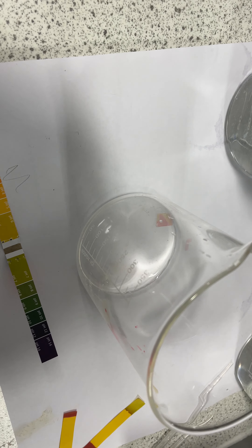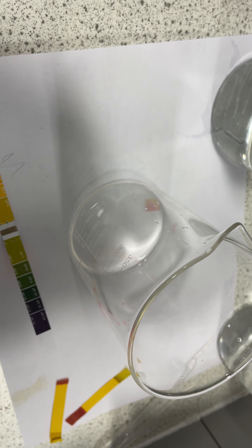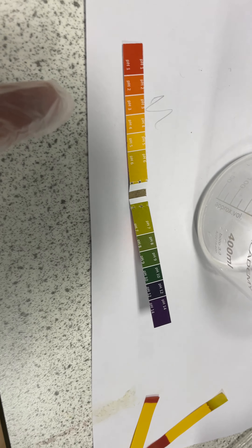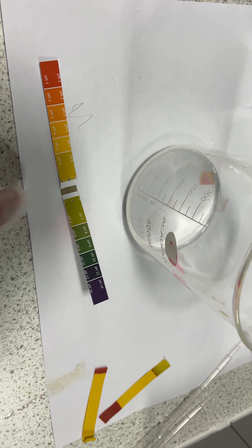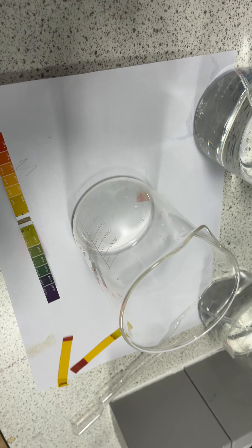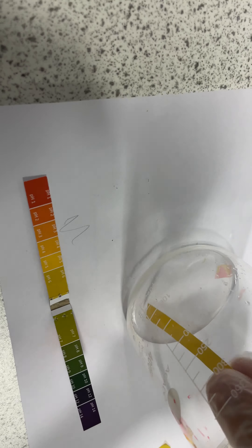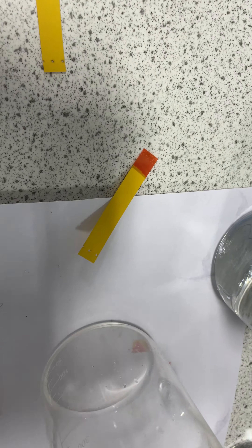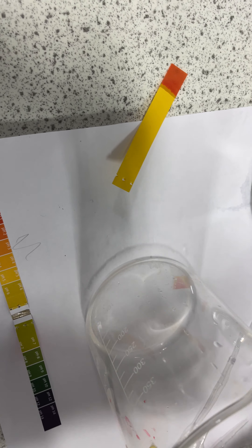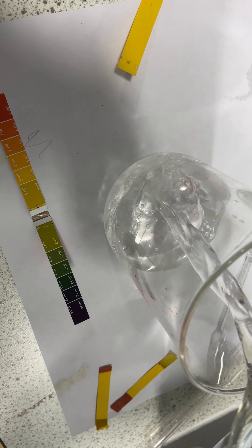I've got plenty of these indicator papers. If I put a little bit in there you should see that go orange or red. Okay, that one's actually coming out green. Take a little bit of the paper — we can use it here — and that one's coming out bright red. So a good example of why we test before we start: we know that this one is actually the water and this one's the acid.